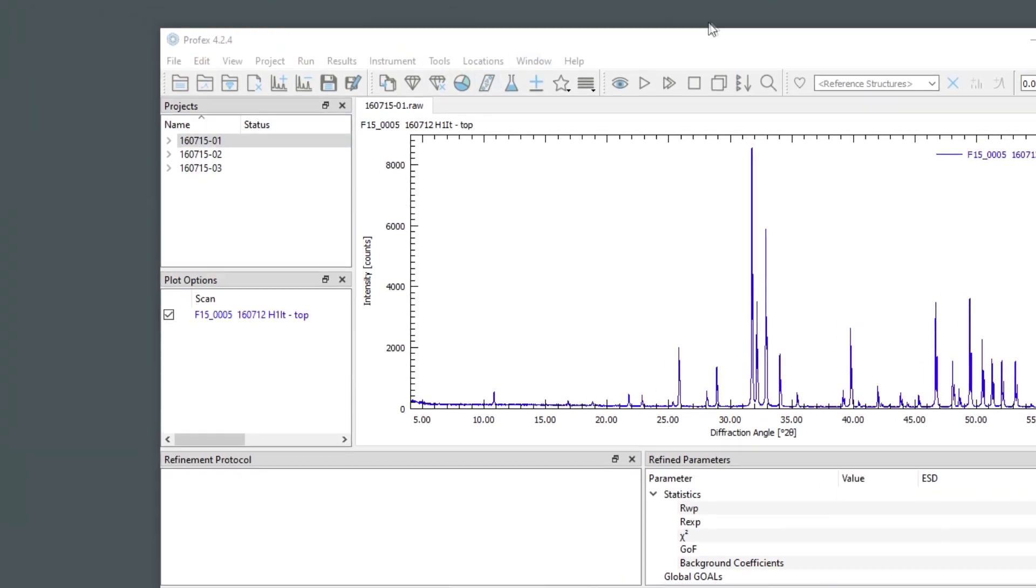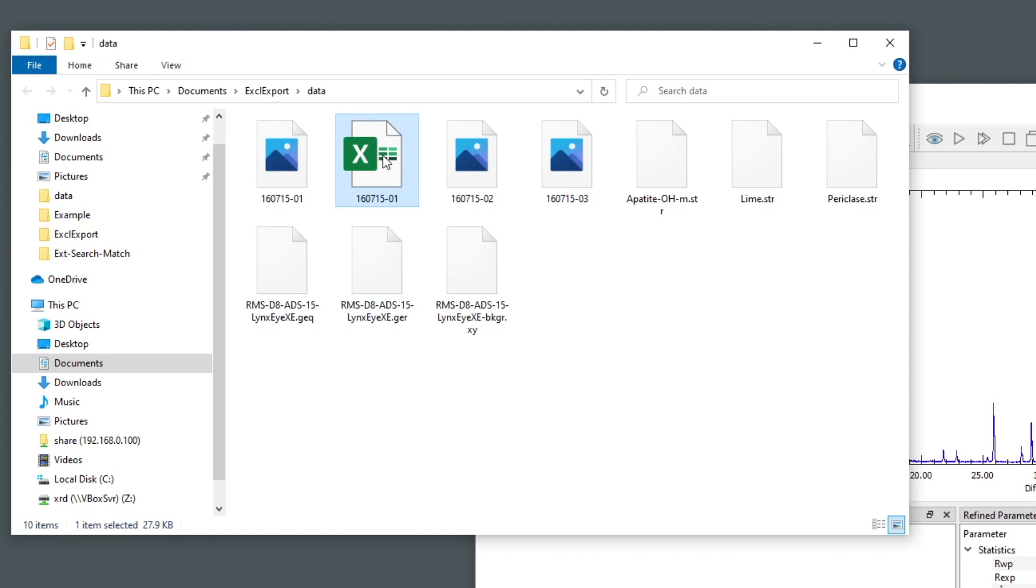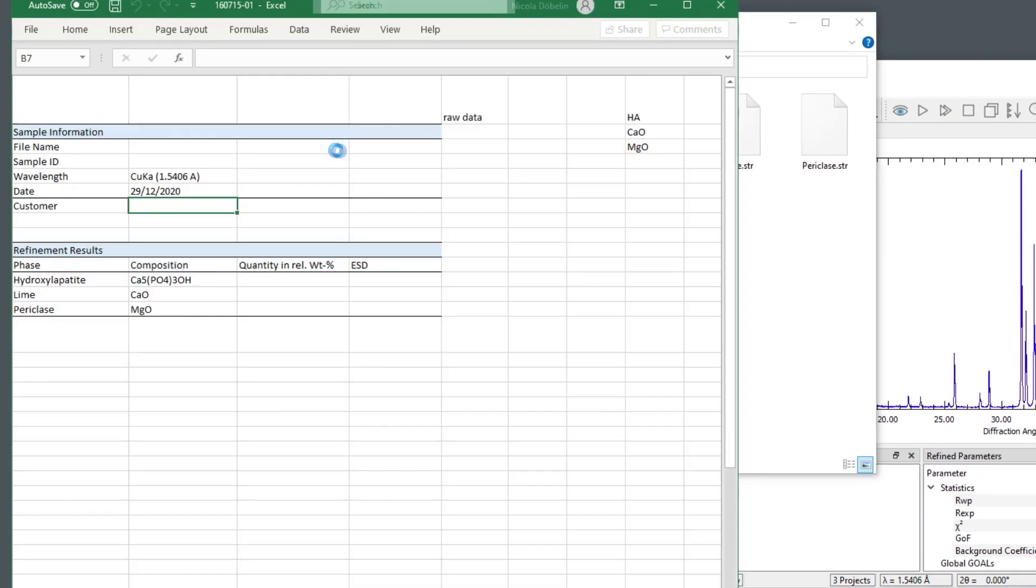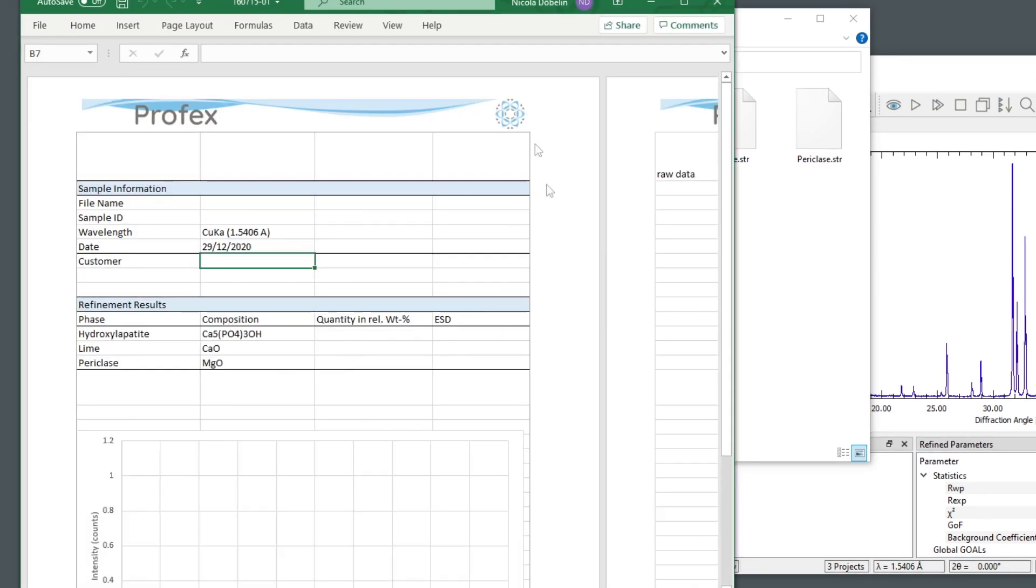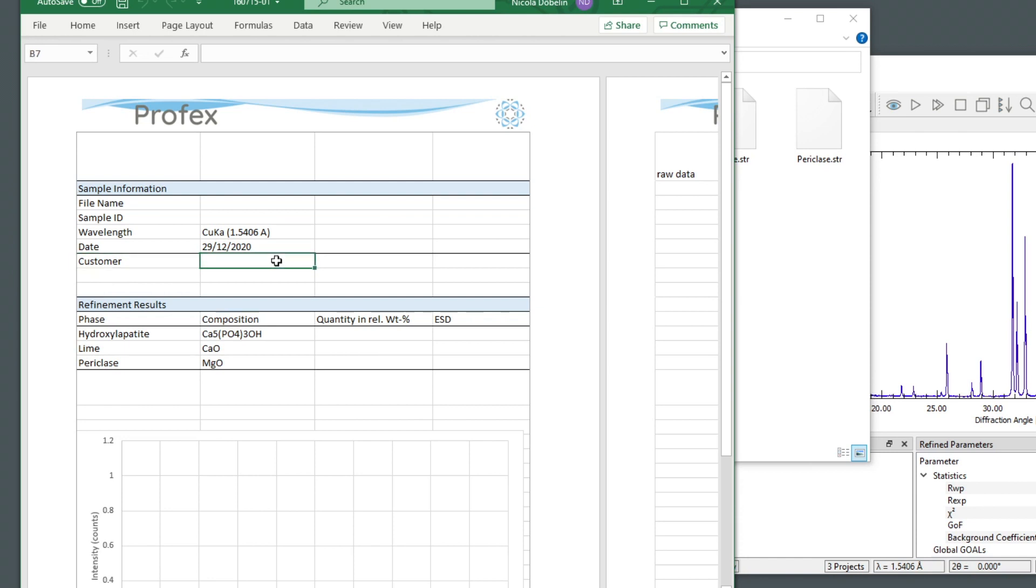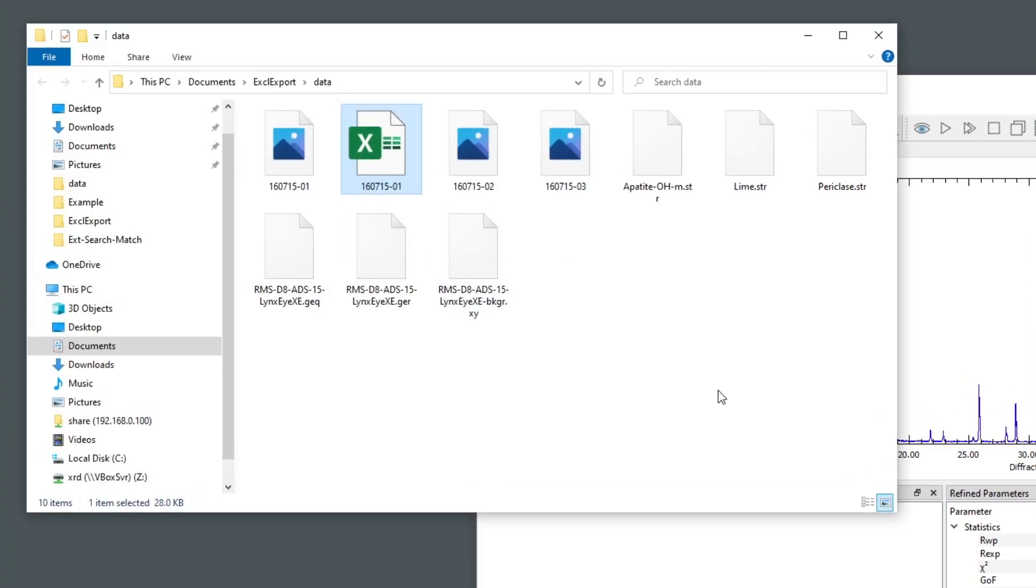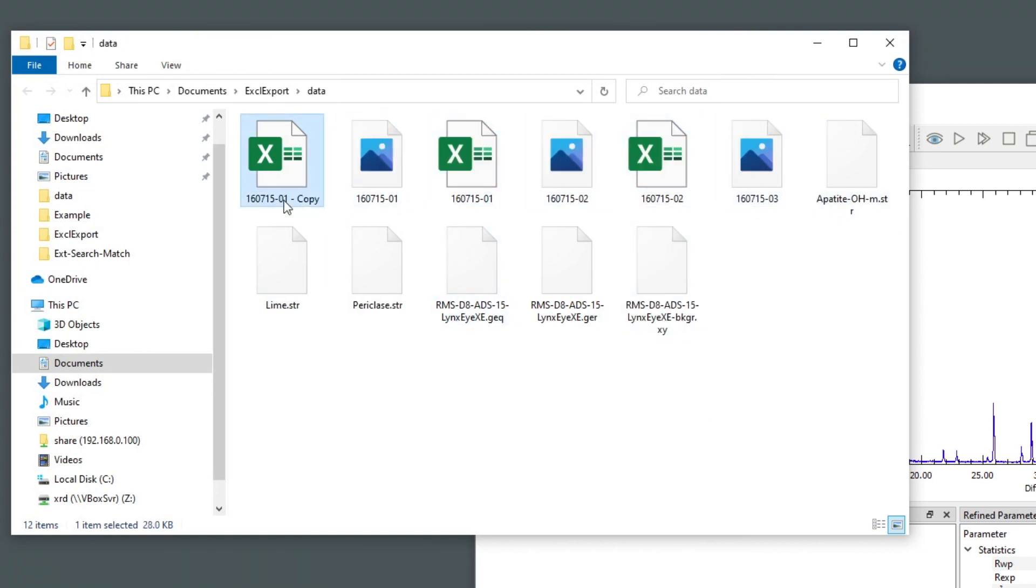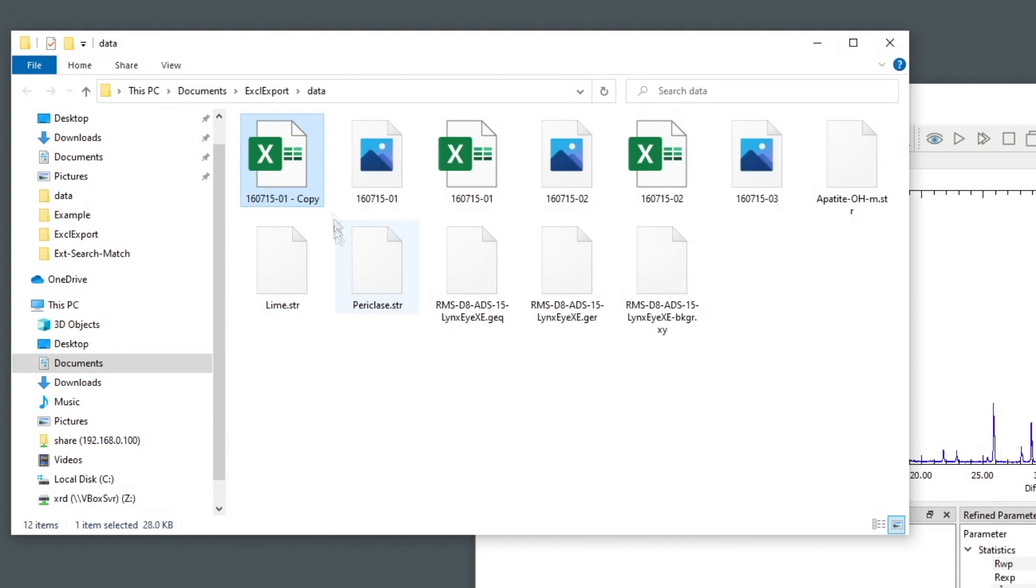So in that case, we can create a copy of the template in the project folder, and already fill in some of the information. For example, if all three files are for the same customer, we could fill in the name already here, maybe additional information like the wavelength or the date, or maybe the name of the operator.